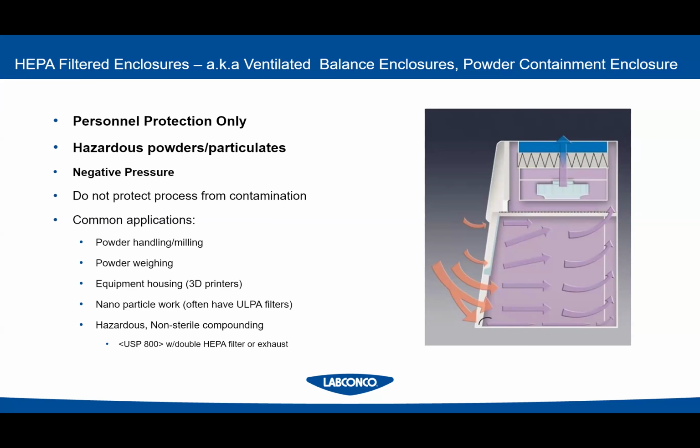How many 3D printers are on this campus? Does anybody know? Yeah, there was just a fun report that I'm sure you guys know of that came out about 3D printers and what all they put off into the world we live in. This is the type of enclosure for that, right? This is going to trap those smaller particulates. We talked about HEPA filters. We also have what are called ULPA filters, which are like super HEPA filters. We can put those in this enclosure as well to trap those really fine nanoparticles better.